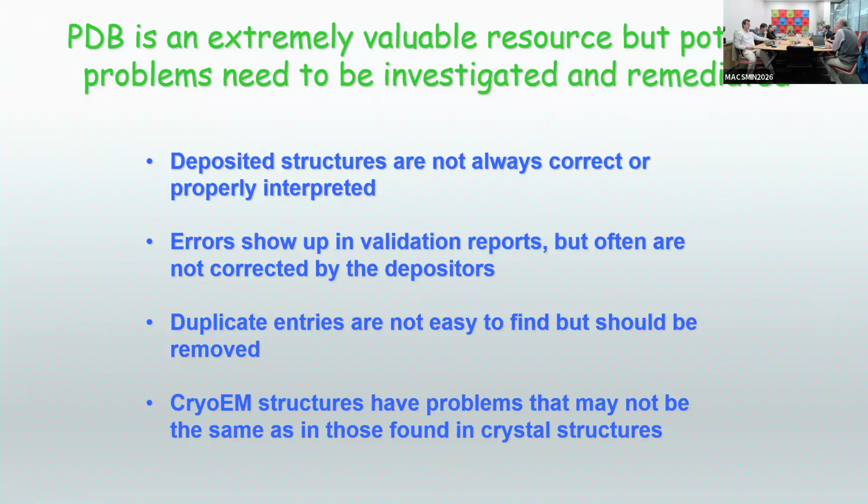And one of the things which was found here is the question of duplicate entries, and that was quite a lot of fun collaborating with the Liverpool group here on it. And of course, the major change right now is that in the last decade, cryo-EM became an important part of structural biology, and I'll be talking about it near the end of my talk.